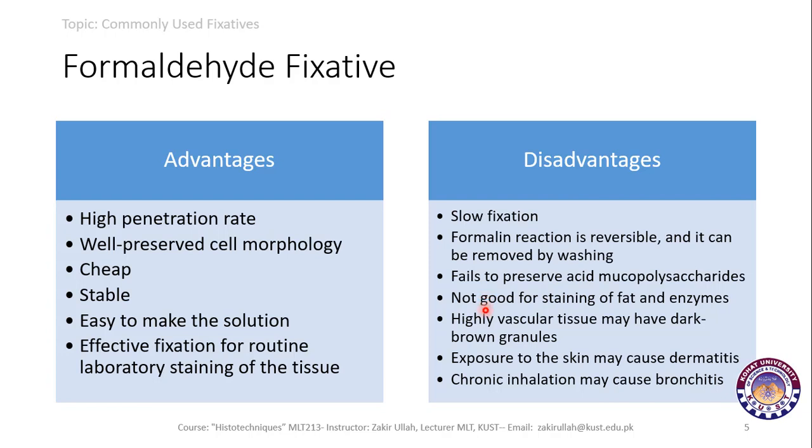Formalin is not good for staining of fats and enzymes, and if there is a highly vascular tissue, the tissue may produce dark brown granules when fixation is performed within the formalin, and exposure to the skin may cause dermatitis.